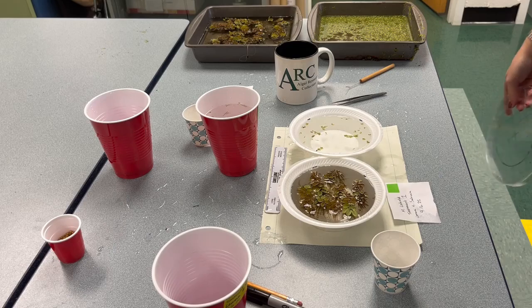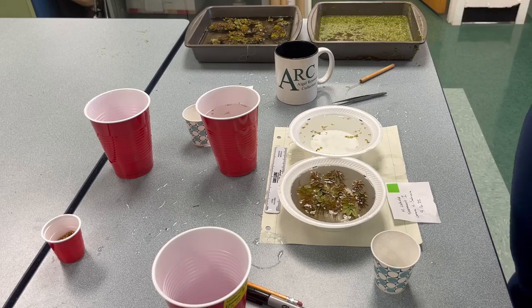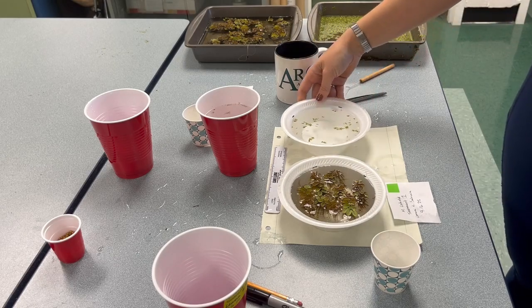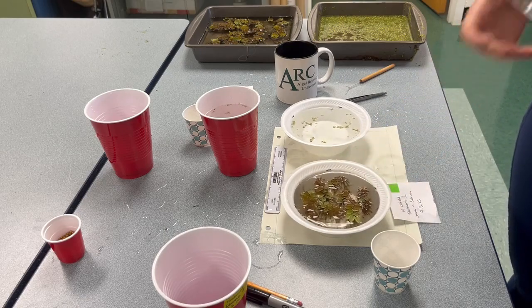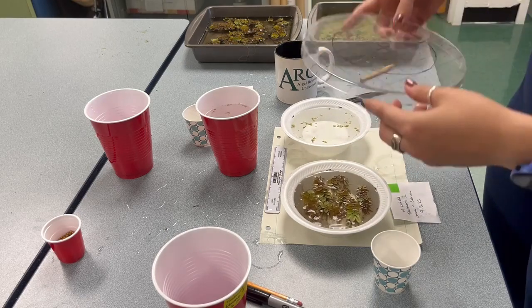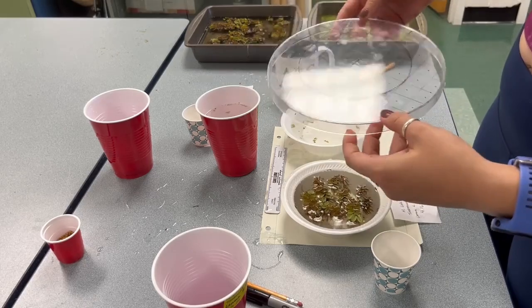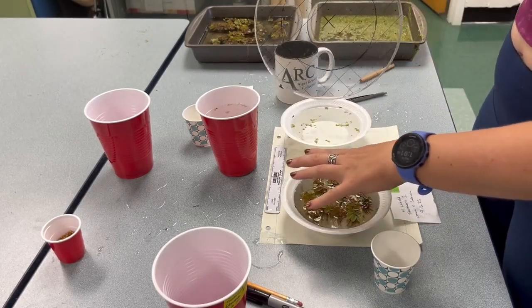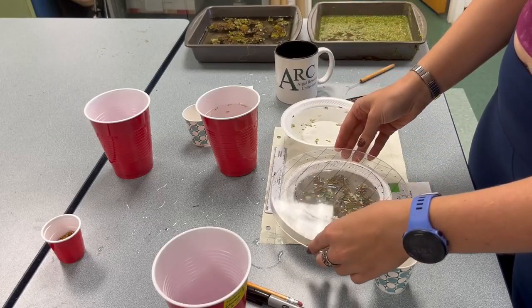So as a note, if you do not have access to ImageJ, which is the software that we use to calculate the surface area of our macrophytes here, you can do a sort of old-fashioned approach, which is take your bowls and overlay them with a grid. So here we've just set up this grid on this petri dish and tried to line up the edge of our surface of the water here with this grid.